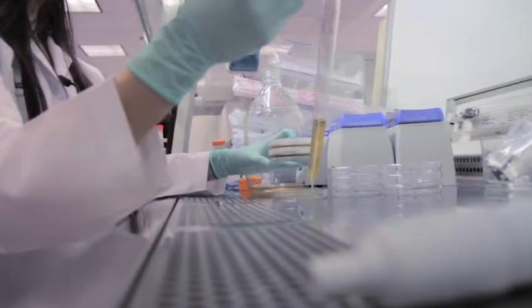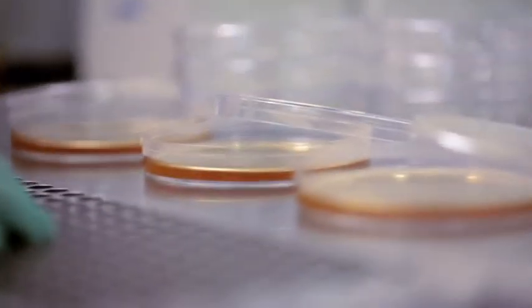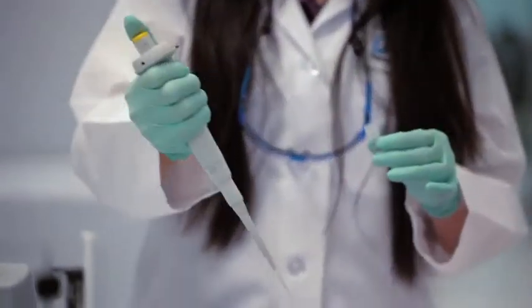Ongoing research and clinical studies are integral to Ganaden's mission. By working hand-in-hand with our partners, our research team helps ensure the most stable, efficacious probiotic products available.